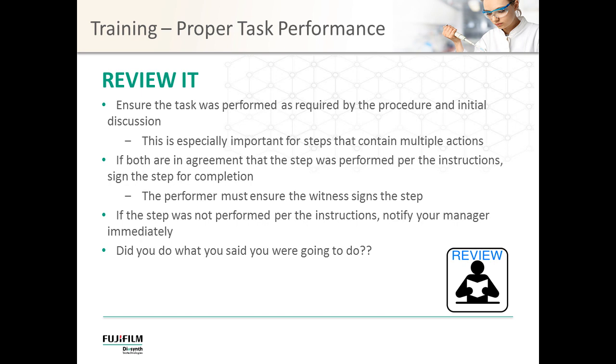If the answer is yes, the performer and the witness will sign the step. If the step was not performed correctly or you did not get the results you expected, then you would immediately escalate to area management. I will tell you that this is the step that gets missed the most. In my opinion, human nature is to complete a task and then move on to the next one. This step may not prevent an error, but it should detect one in a more timely manner.